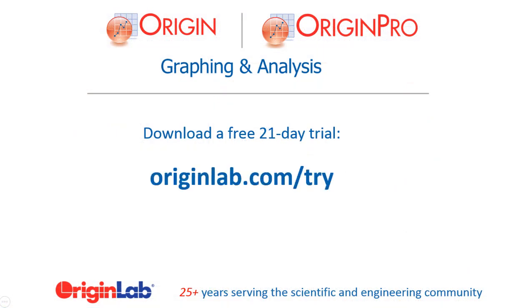Download a fully functional trial version of Origin today, and see for yourself how our user-friendly, yet powerful interface and tools can help you to visualize, explore, and analyze your data.